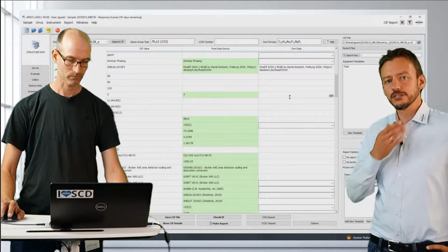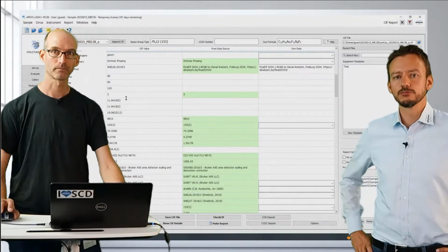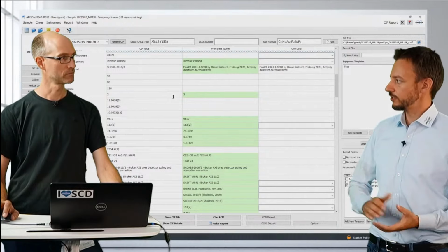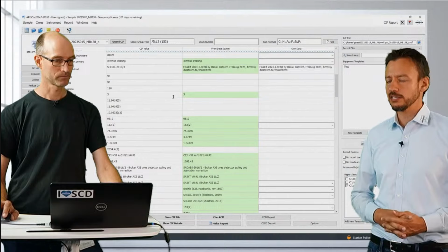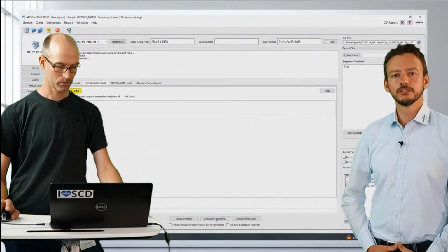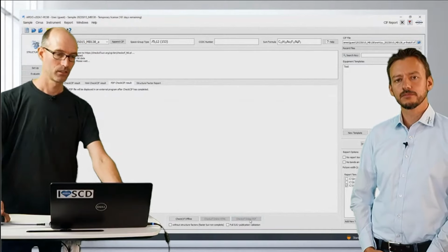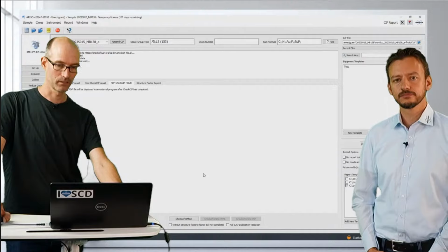Okay, that's really cool. So for me as a service crystallographer here at Bruker, to some extent, it's of course also important that I provide all the necessary files together if I send out my data. So could you also do a CheckCIF and automatically save the PDF feedback? Yes, of course. If I do here an online CheckCIF with PDF, I will get this PDF report. Takes a little while again.